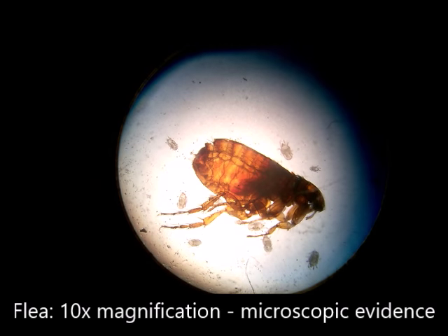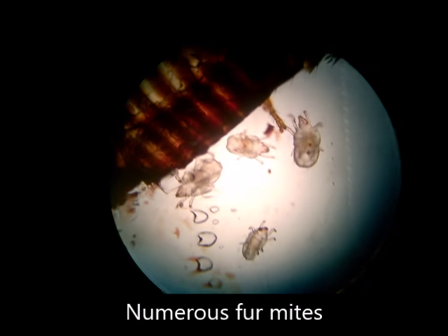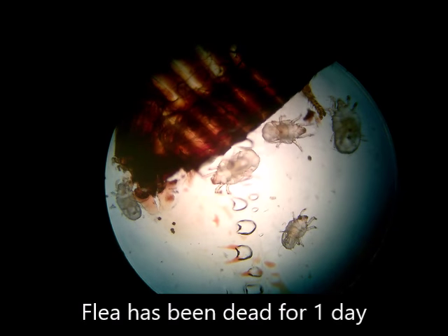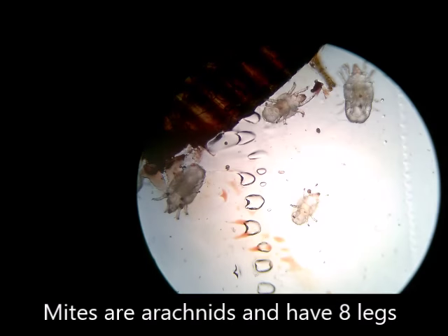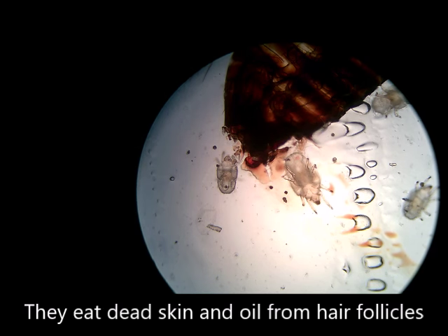Here we can see one of the fleas under a 10x magnification. Upon close examination, however, numerous fur mites are seen. Even though the flea has been dead for a day, the fur mites are still alive and active, and start moving when exposed to the microscope light. These mites are simple arachnids with 8 legs. They live on a diet of the cat's dead skin and oil from its hair follicles.